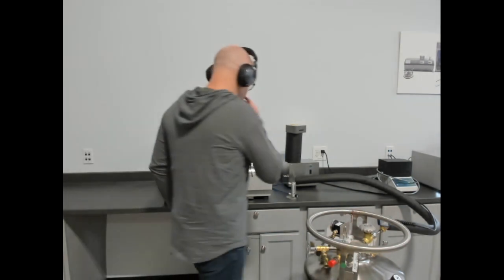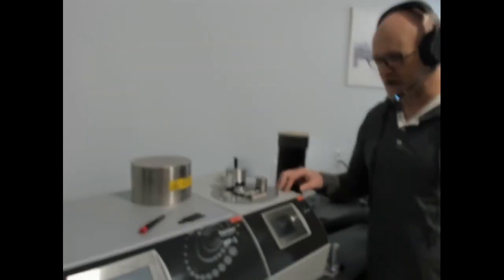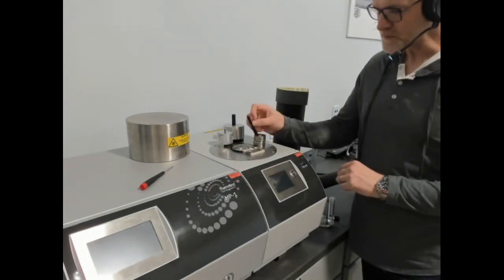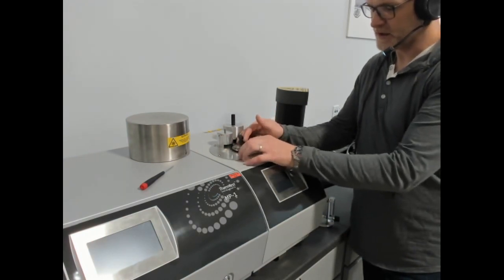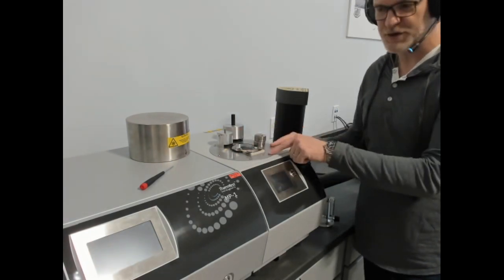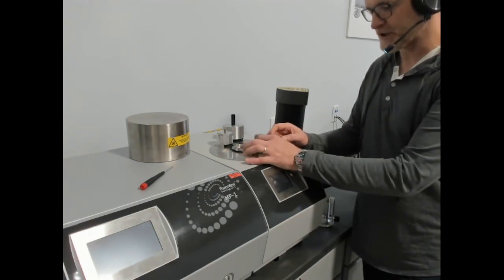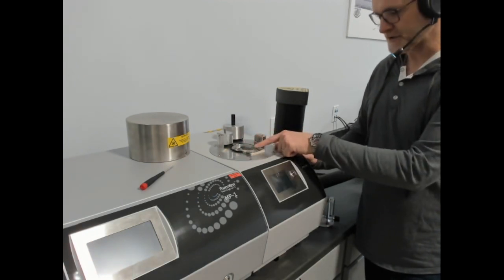So maybe what we'll do also is show you a quick sample setup of the temperature platform to help bring that full circle. This is your TPS sensor, 4 contacts. We're going to put those into the 4 contacts of the temperature platform. All the sensors can be used inside a temperature platform or a room temperature sample holder, so it makes the use of the sensor quite flexible. We'll secure those electrical contacts. So now the sensor is set electrically.